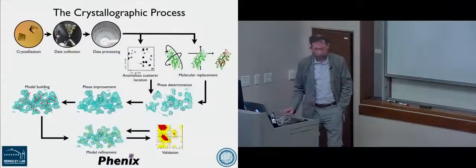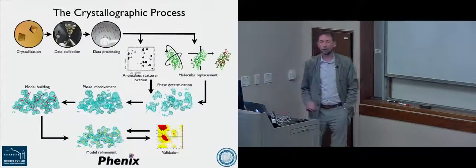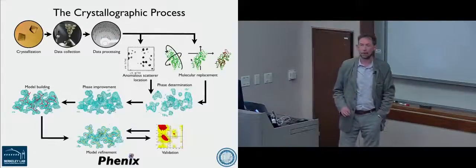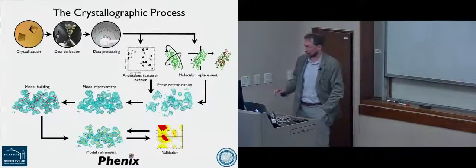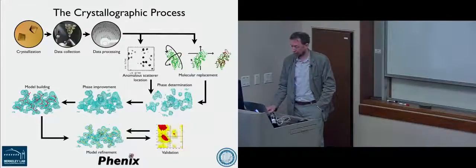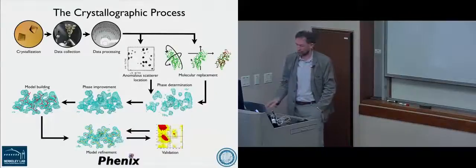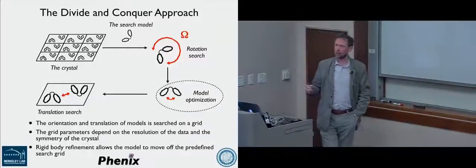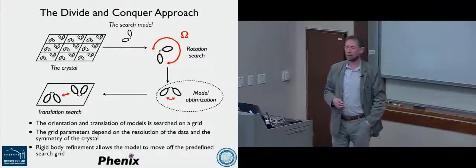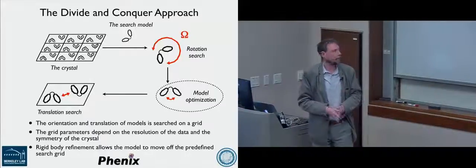And just to remind everybody, molecular replacement is the other way to solve the phase problem. And as we said this morning, it's actually the predominant thing that we tend to do these days in crystallography. But clearly, if you're trying to solve a new structure, you've got to go down the routes that Tom mentioned. And I'm going to assume that people are sort of familiar with the idea of molecular replacement, so I'm not going to talk a lot about the background to the technique itself.